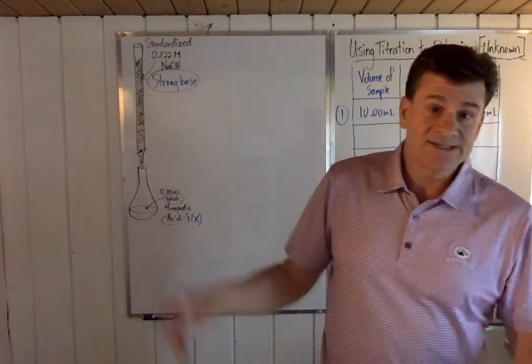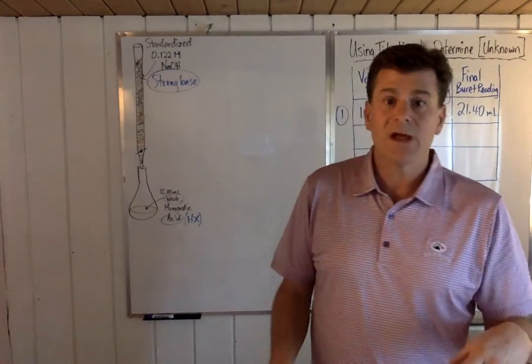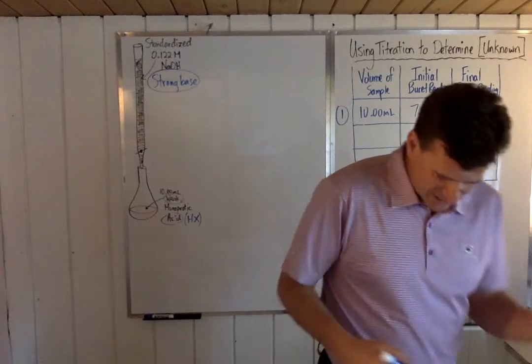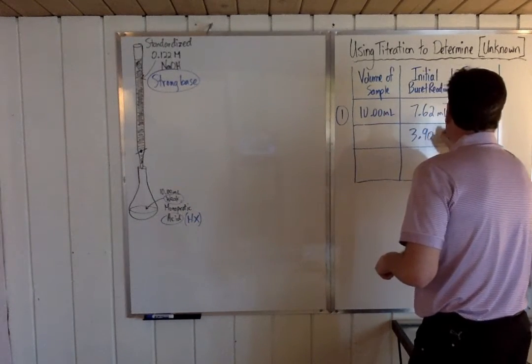So I set up and maybe add some more base to fill it back up again. And let's say I start my second trial and it starts at 3.90.